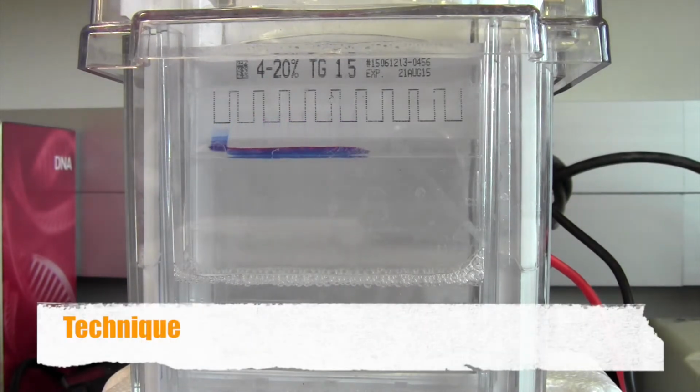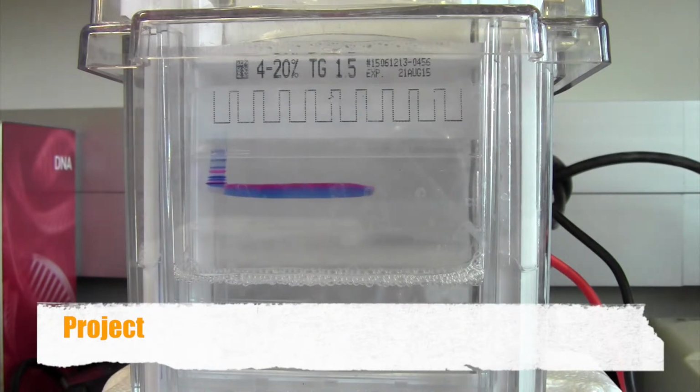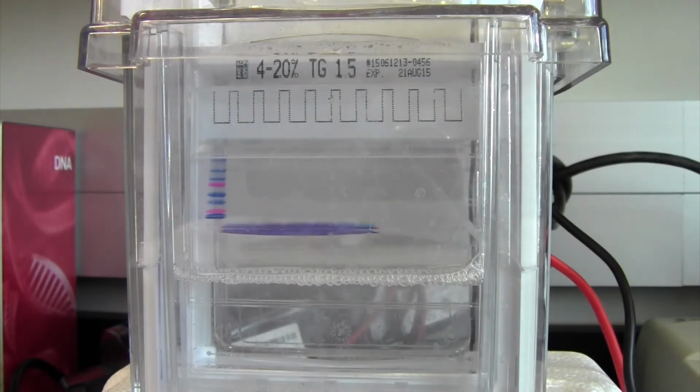SDS page is a technique used to separate a protein mixture by size through gel electrophoresis. My project was to screen BEAS2B cell clones expressing line 1 and mutant line 1.